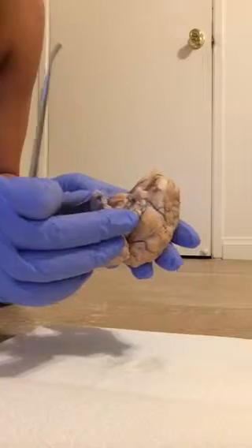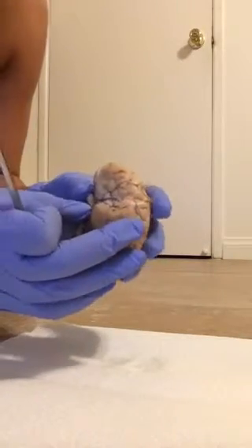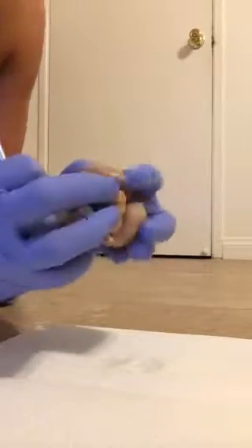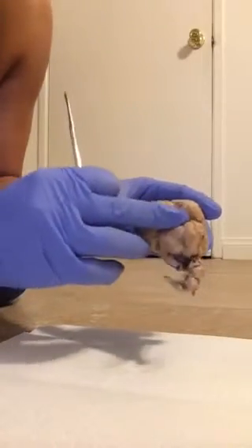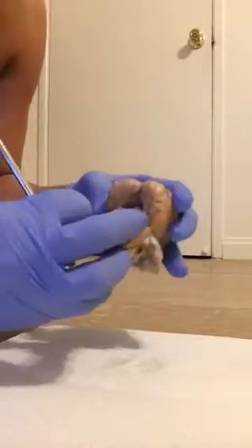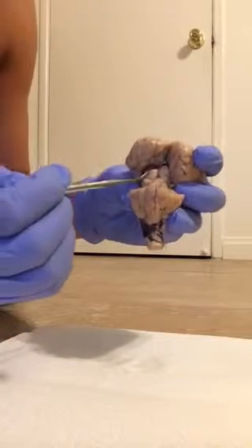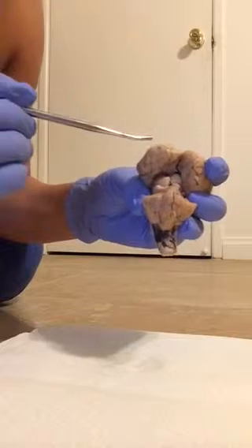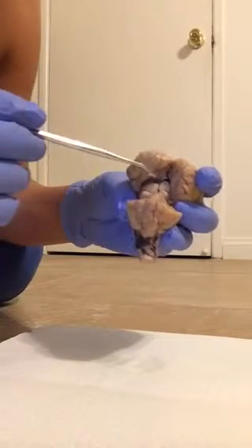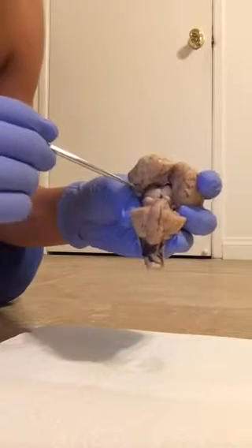Now we'll move our attention to the midbrain. If you separate the cerebrum and the cerebellum here, you will see a set of four, and that's going to be our corpora quadrigemina, which is just the body of four here.